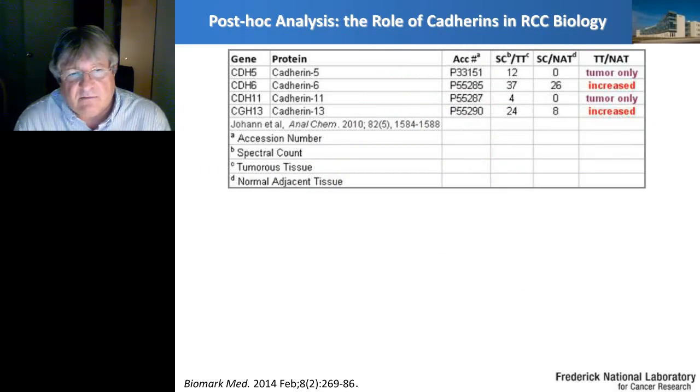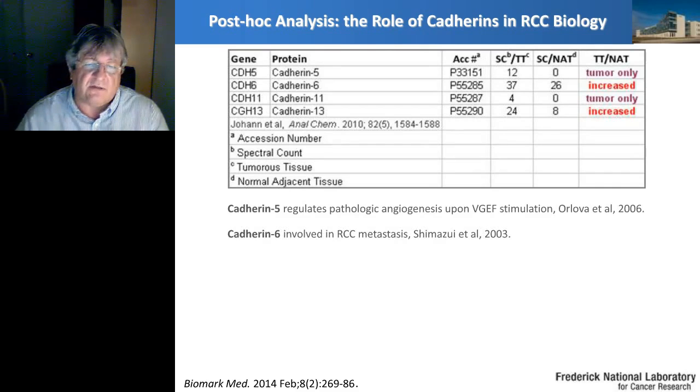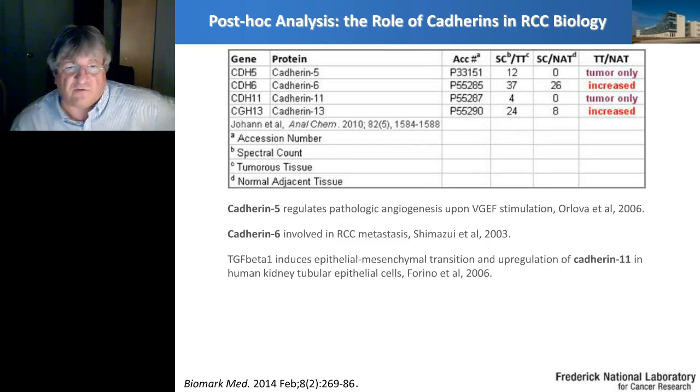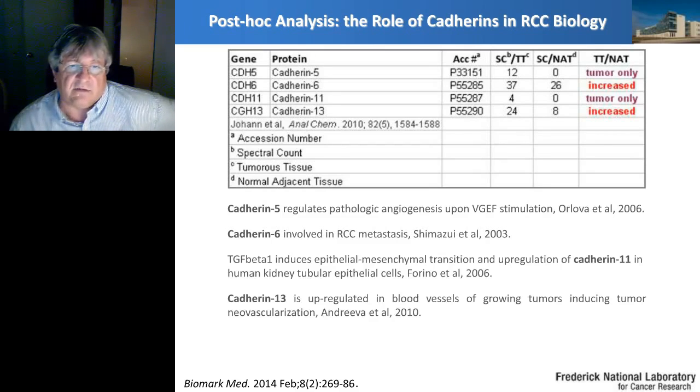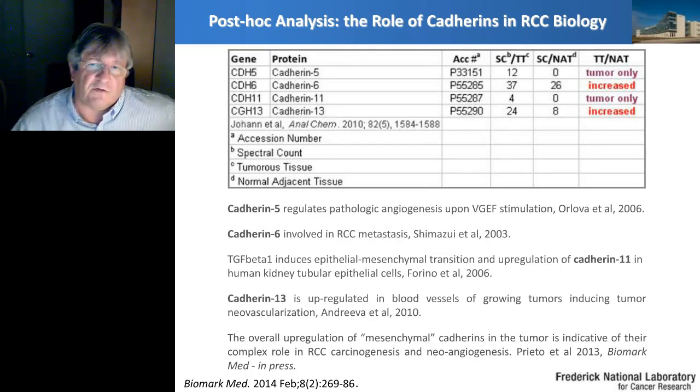So after this analysis, we actually found a study that was a genomic study of the same tumor, clear renal cell carcinoma, on a much bigger cohort of patients, and we wanted to see how our analysis coincides with the findings of the genomic data. Actually, this slide shows just how much of those proteins are relevant based on other studies.